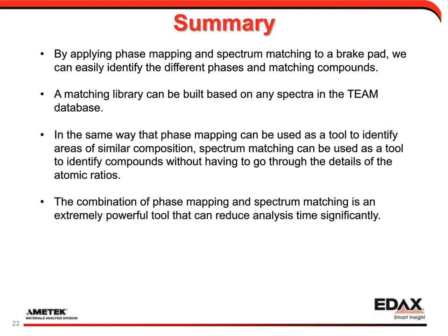And the combination of phase mapping and spectrum matching is a very powerful tool, in my opinion, that can reduce the time it takes to analyze samples significantly, especially if you're running the same type of samples where you can build up a library that will cover most of what you're expecting to see. And even though sometimes it won't match your library, then you'll have that information that this is something I haven't seen before and can go in and do the additional analysis.